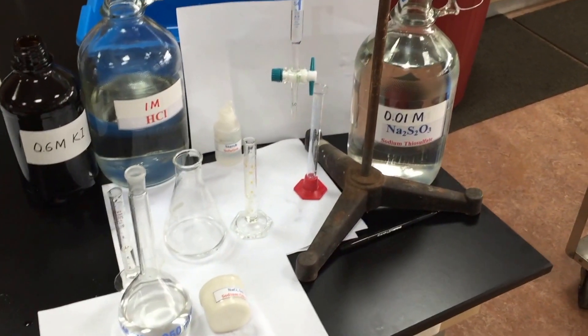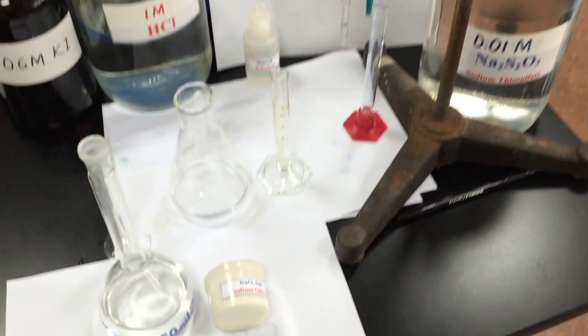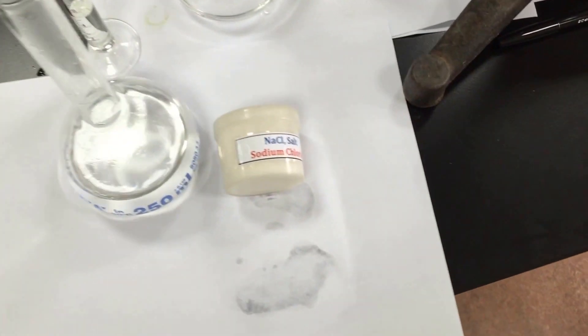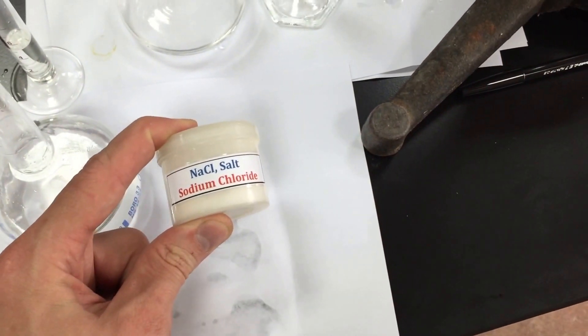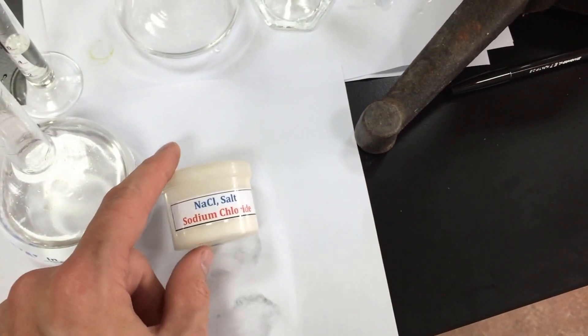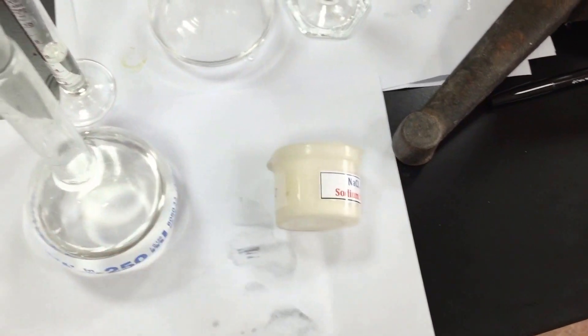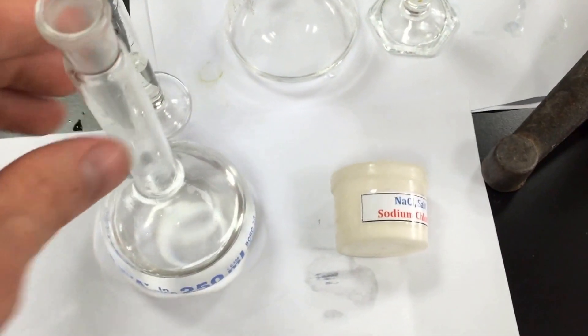This experiment is determining the amount of iodate ion that is present in table salt. So what we have here is table salt. I've taken 50 grams, accurately weighed out 50 grams.